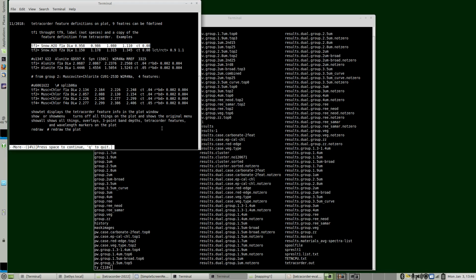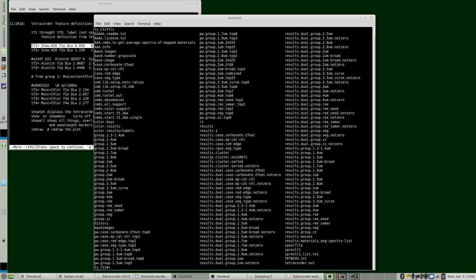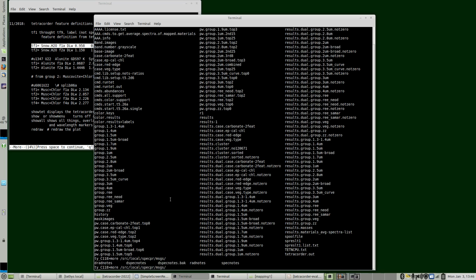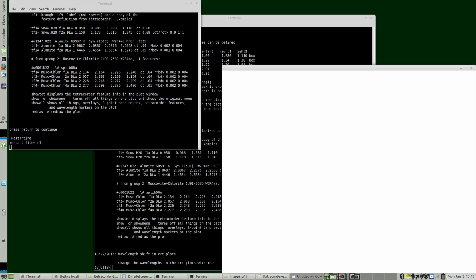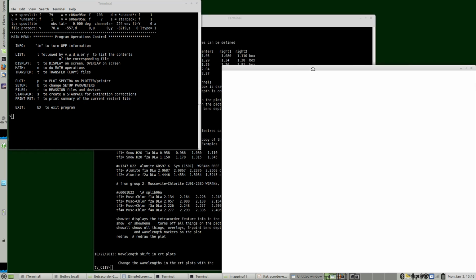This file here is located in the source code directory and dSpecPR is the developmental. dSpec notes shows this file. Okay. So I've started SpecPR.